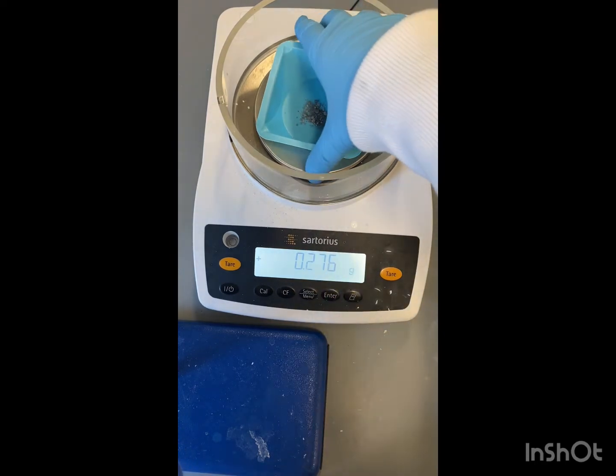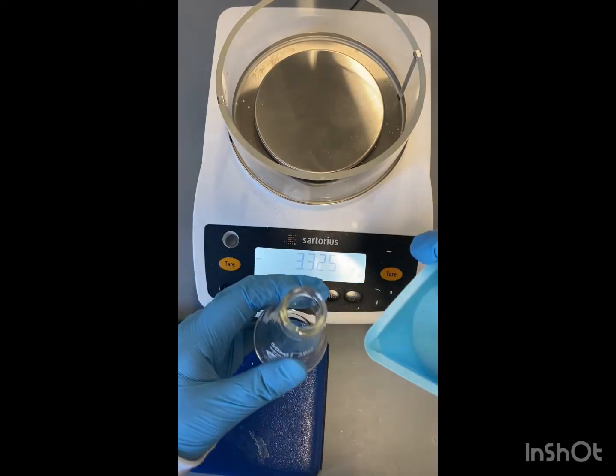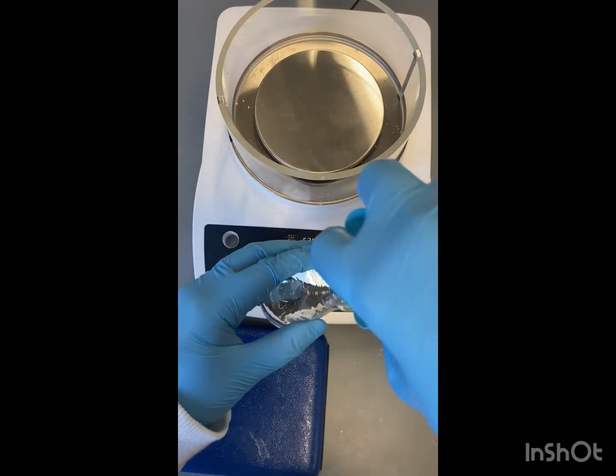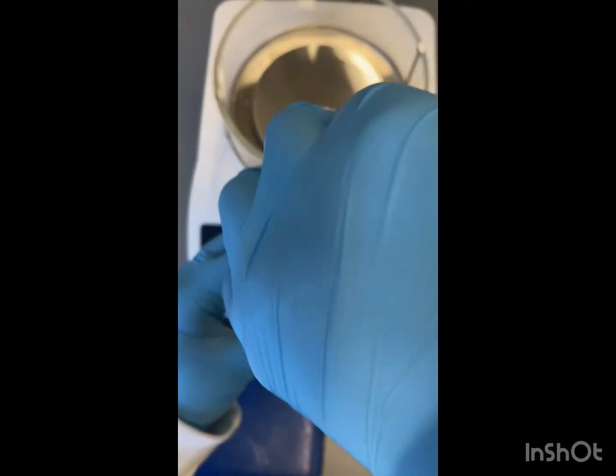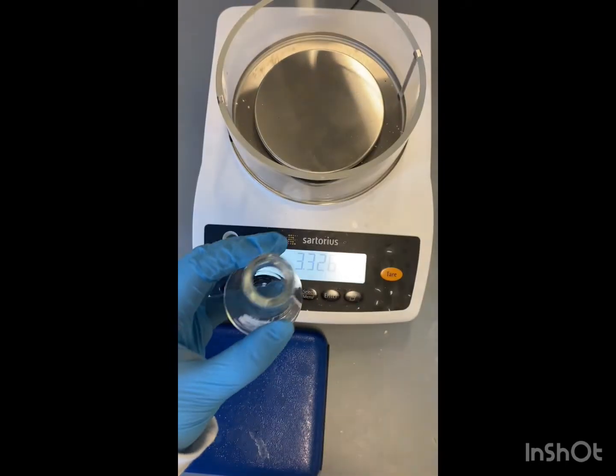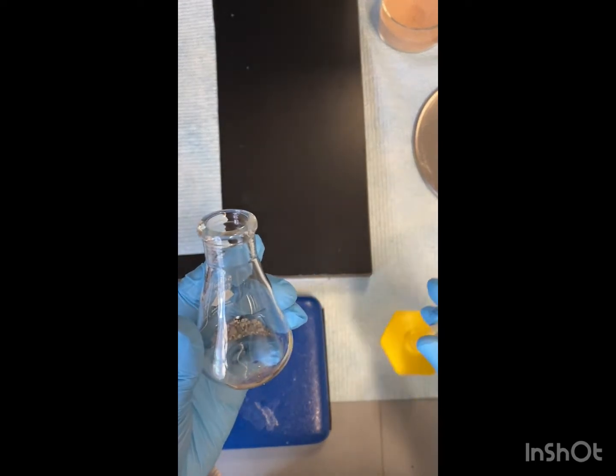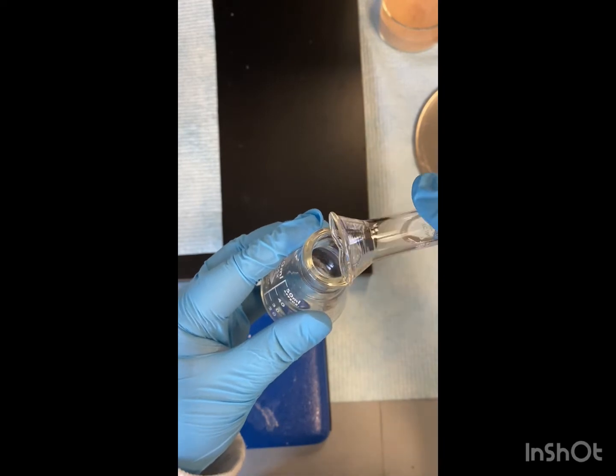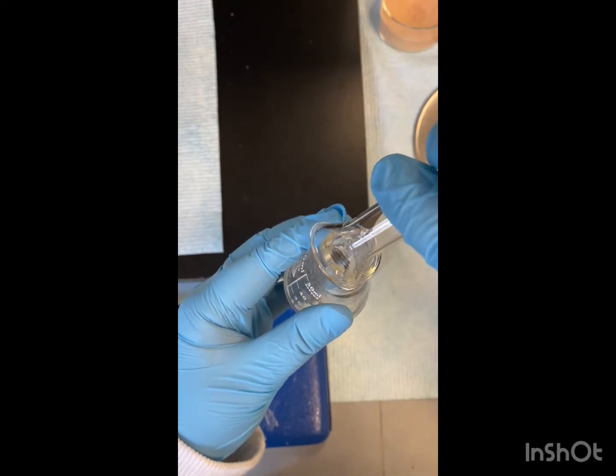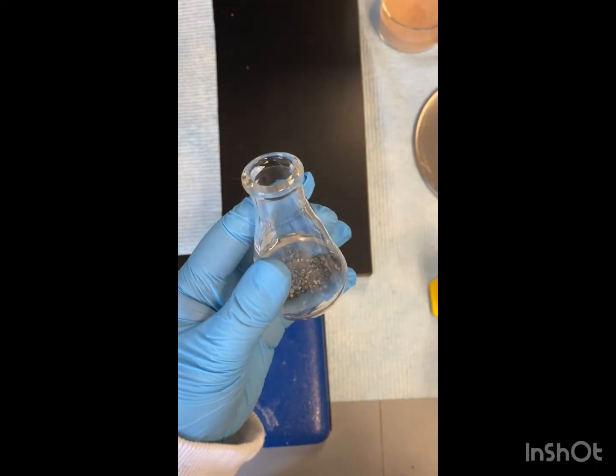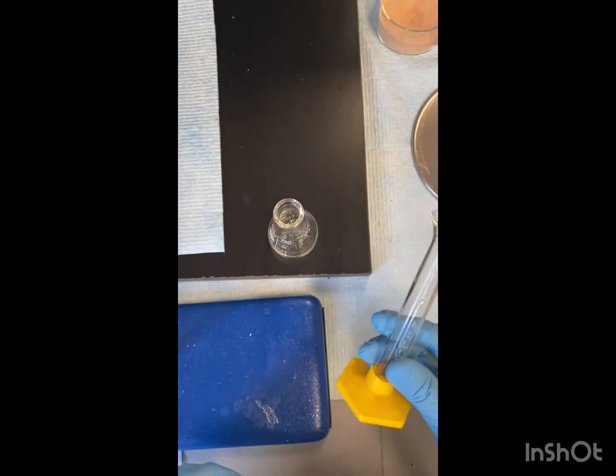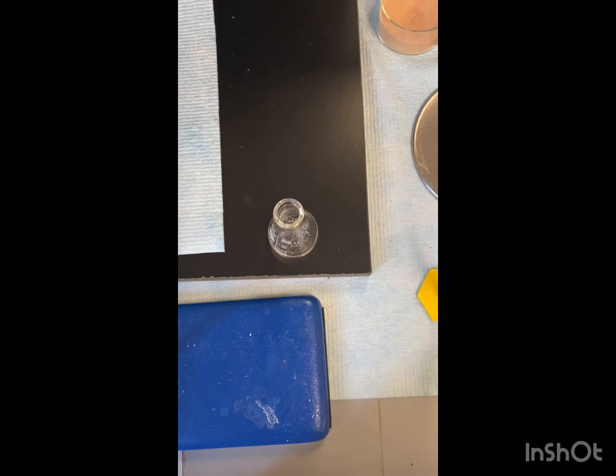We're going to add our benzoic acid to our flask. So we've got our benzoic acid in our flask. Now we're going to add 10 ml of distilled water. And then we're going to get more distilled water and put it in a different flask, and put both of these on our hot plate until they reach a boil.